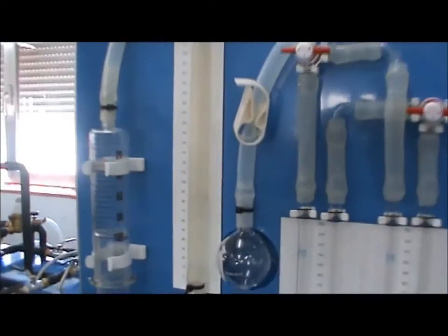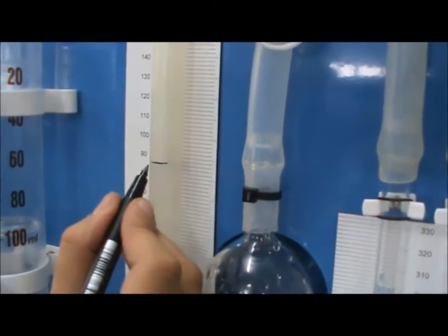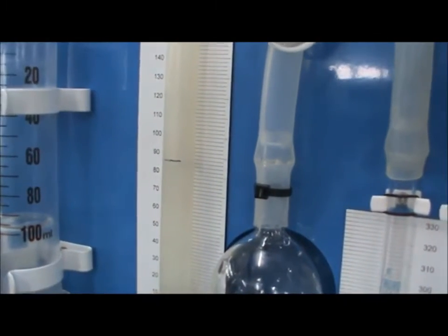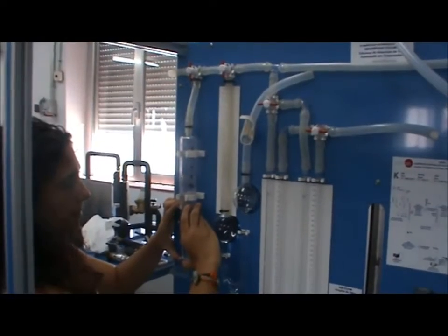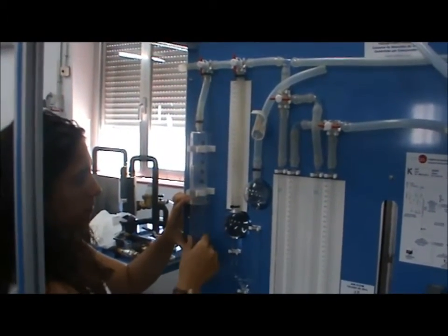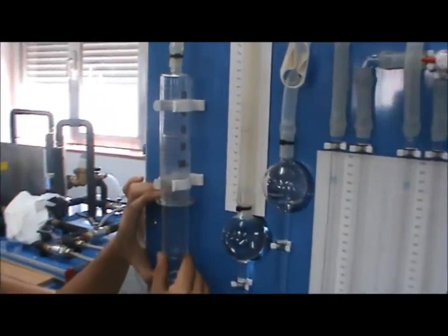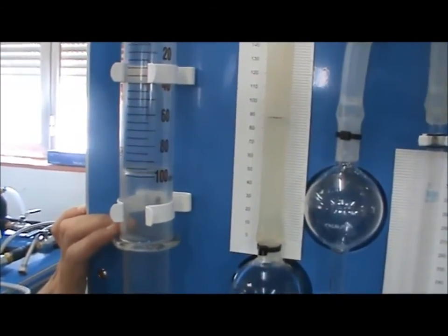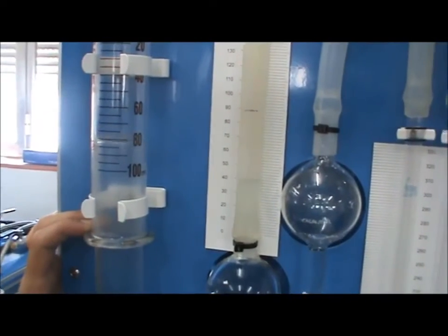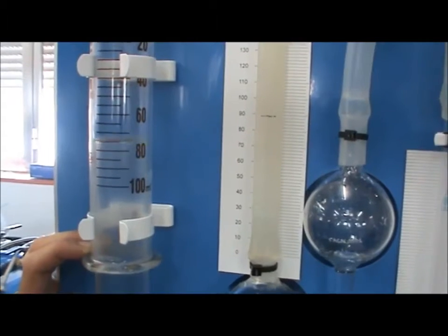The solution level will drop slightly. Mark the level with a pen when it has stabilized. Push the plunger of the syringe upwards to introduce the gas sample in the vessel with the KOH solution. Pull the plunger back down so that the solution returns to the previously marked level. The amount of CO2 absorbed by the KOH solution is measured by the volume reduction in the syringe.